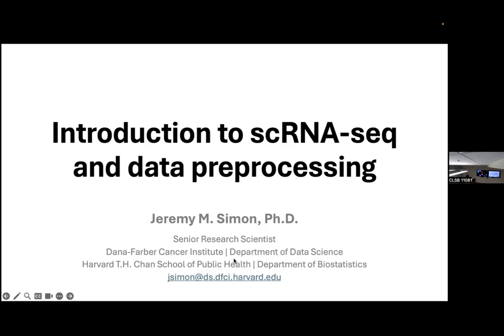So the way today is going to go, today is an introduction to single-cell RNA-seq and some steps for data pre-processing. We have 2 hours where we're going to talk about some of the biological rationale for why we even do this and how we go about doing the experiment. And then there will be a live workshop for everybody, both in person and those on Zoom, to go through a basic pre-processing workflow using a tool called AlevinFry.